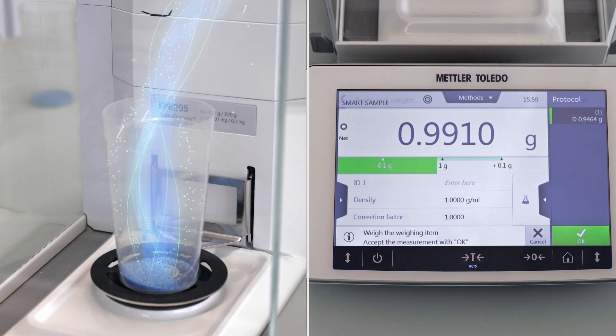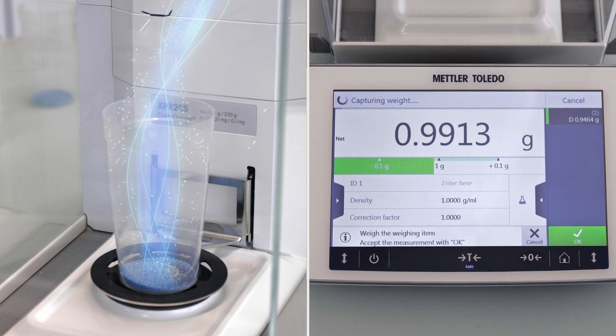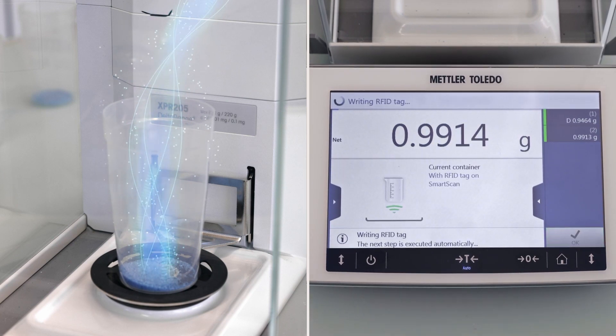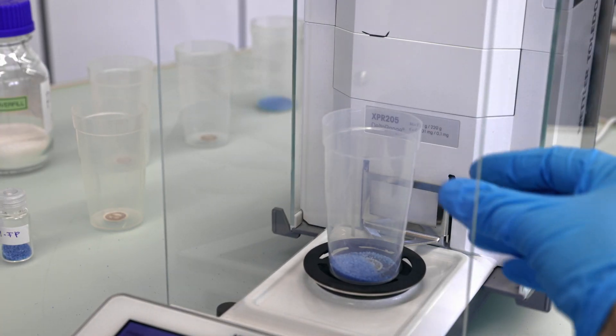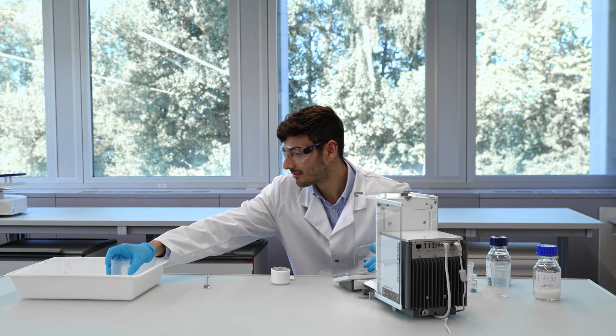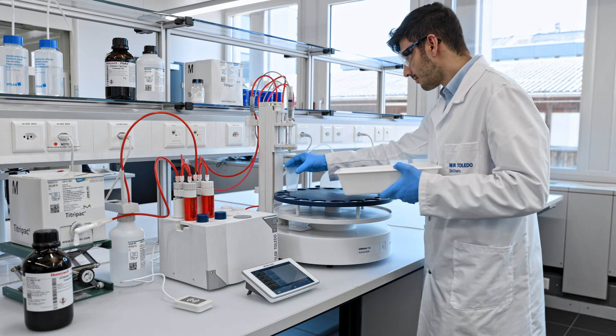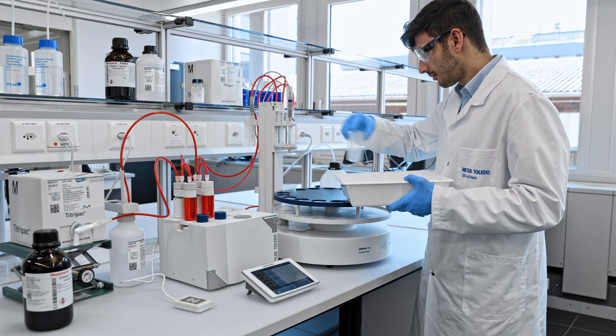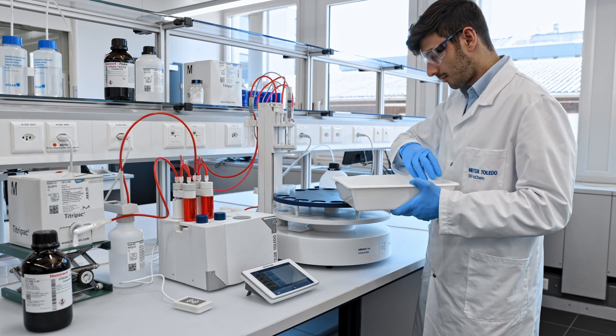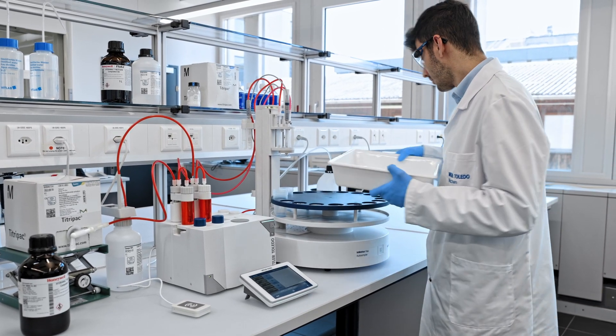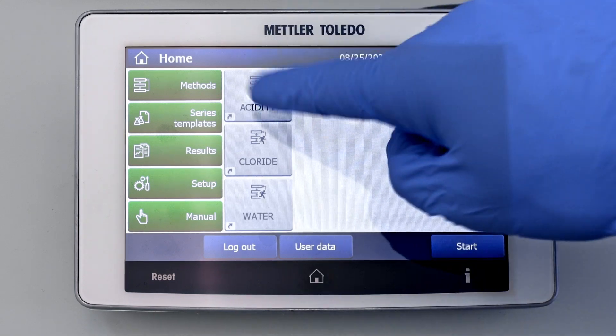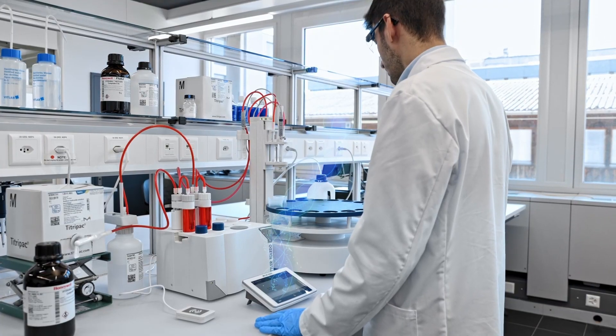The sample information is stored on the smart tag as part of the weighing process, eliminating written errors. Simply place your beaker on the titrator or in motion auto sampler and don't worry about the sample position or sample data. Start your analysis with just one click and let the titrator take care of the data management.